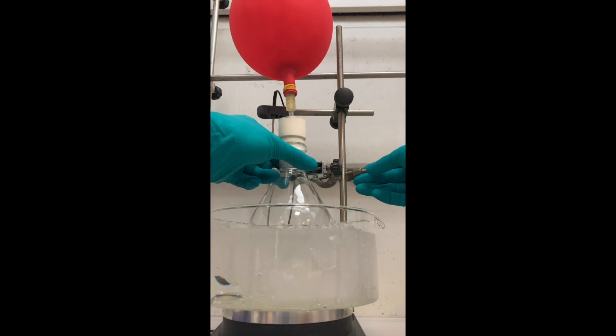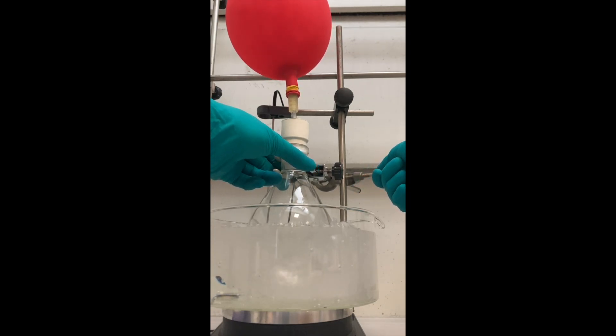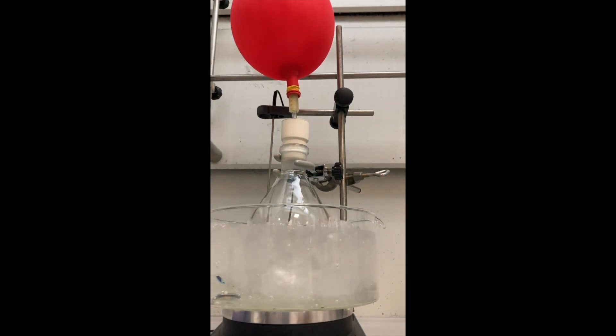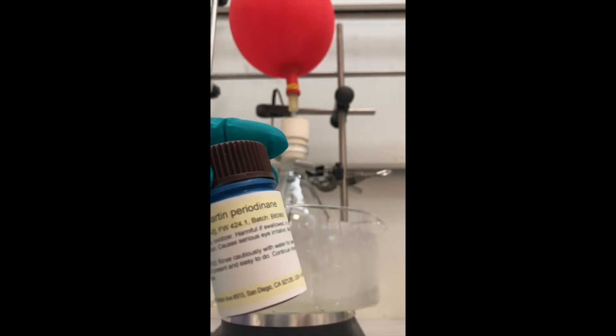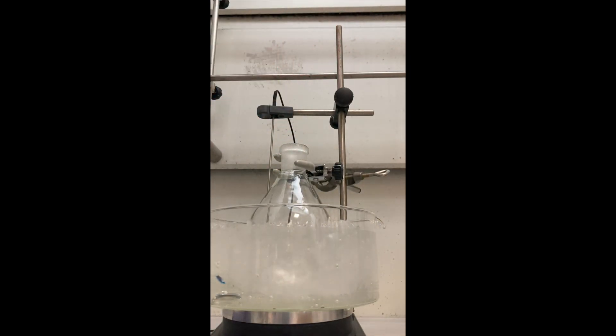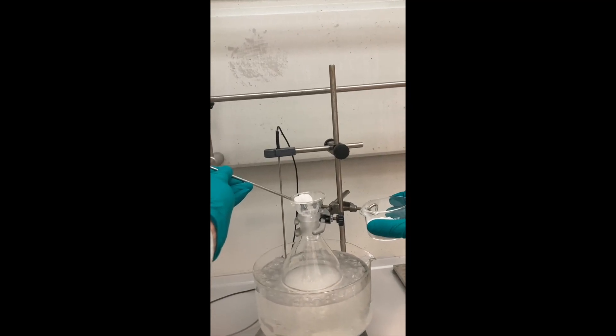To a stirred solution of my alcohol dissolved in dichloromethane under an argon atmosphere, I added solid Dess-Martin periodinane in several portions over 30 minutes, while vigorously stirring the reaction mixture at zero degrees Celsius.